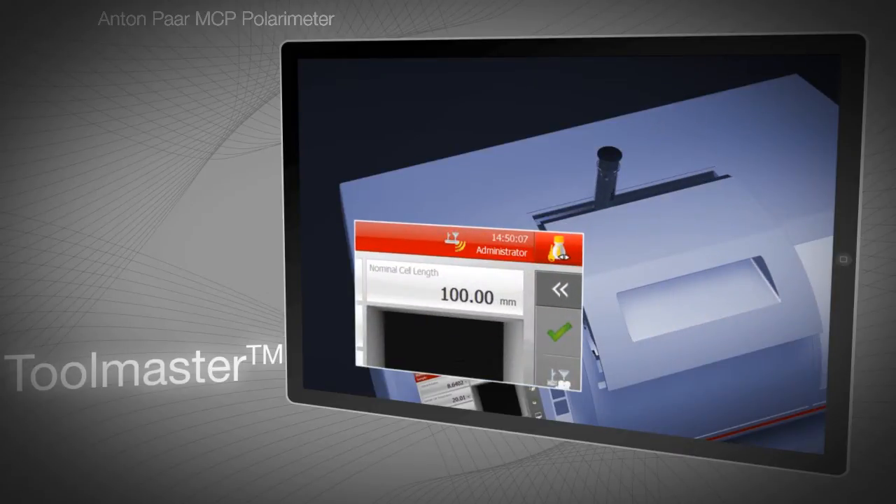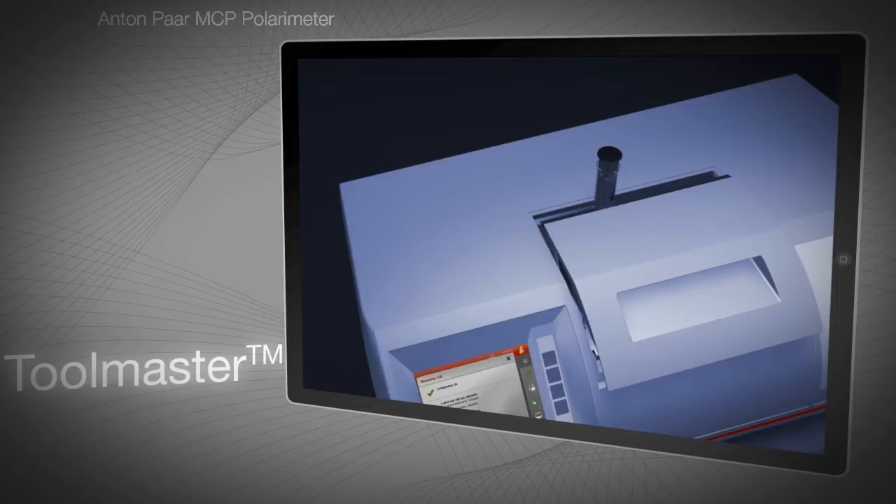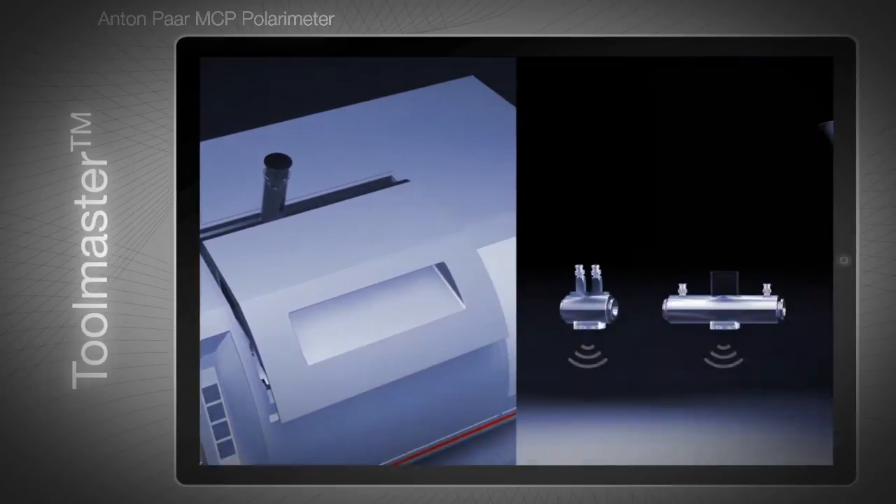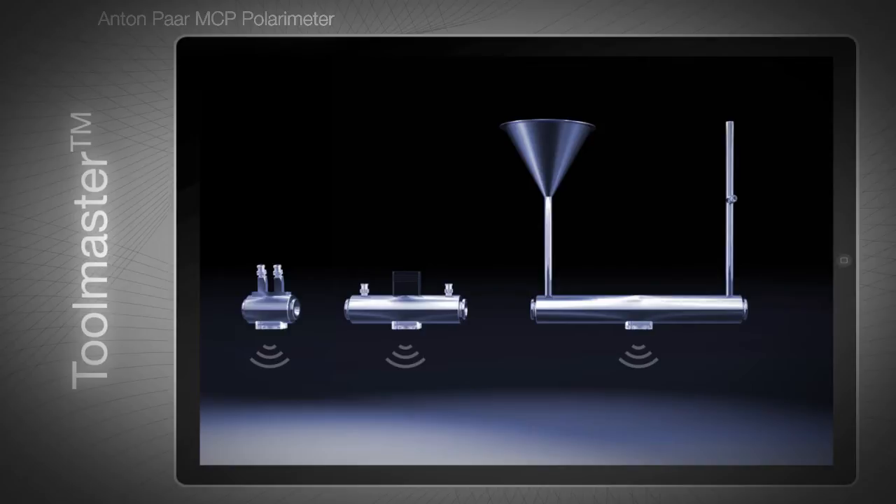Toolmaster automatically detects which sample cell is being used and automatically checks whether it is the right cell for the measurement. With the Toolmaster feature, you can be a hundred percent sure that your sample cell is correct for the measurement.